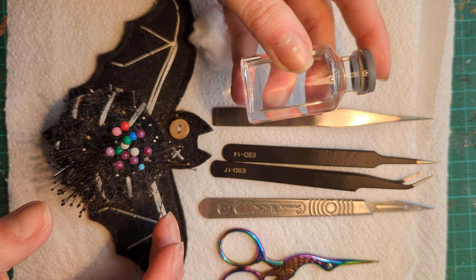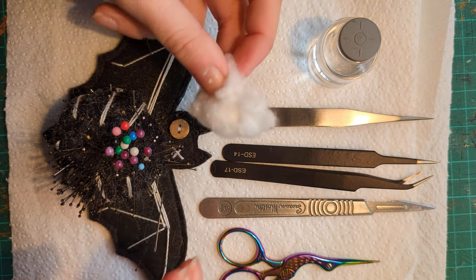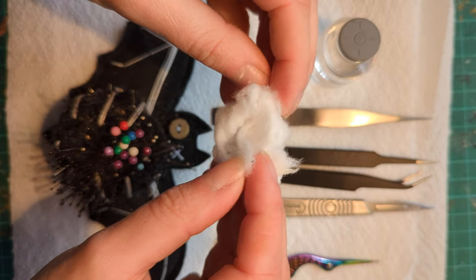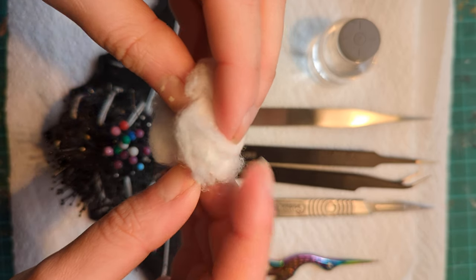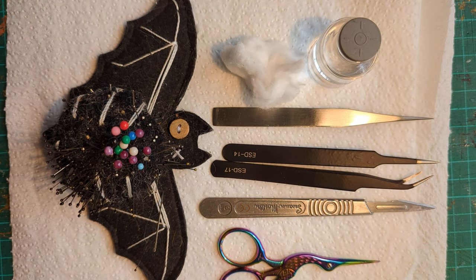We have isopropyl alcohol, which is what we're going to use to clean and disinfect. I have some cotton wool — just a natural fibre cotton wool that we're going to use to stuff once it's clean and dry. The reason I use natural fibres is because they have a little bit more play to them than synthetic fibres, but synthetic fibres will also work absolutely fine.